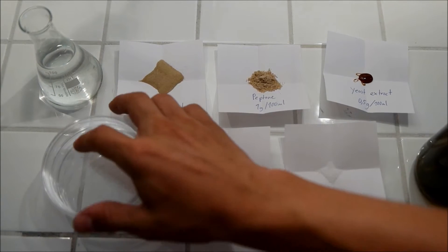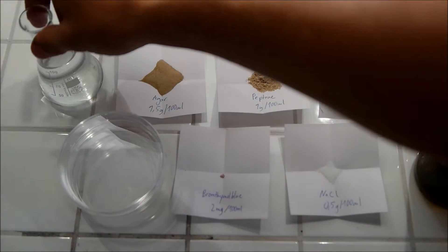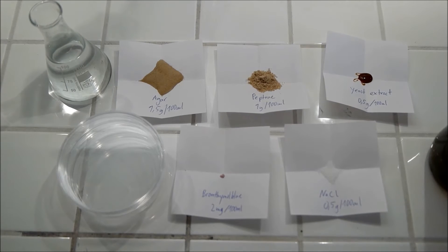For 100ml I use 3 aseptic Petri dishes and 100ml of water. Just put everything together in the bottle, put it in the microwave for 70 seconds and it's done.